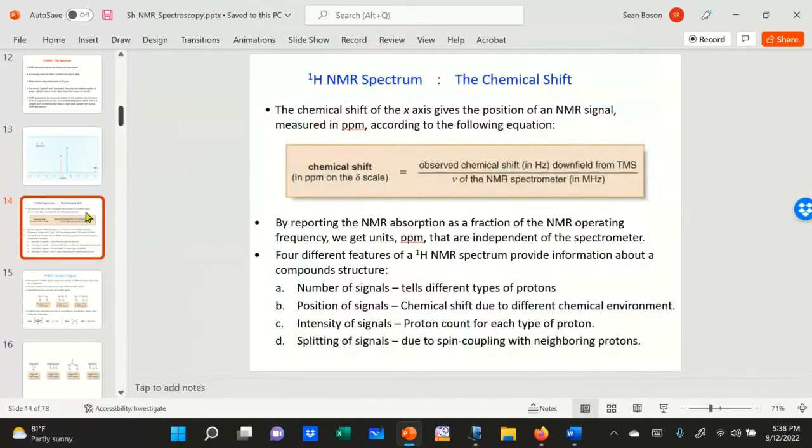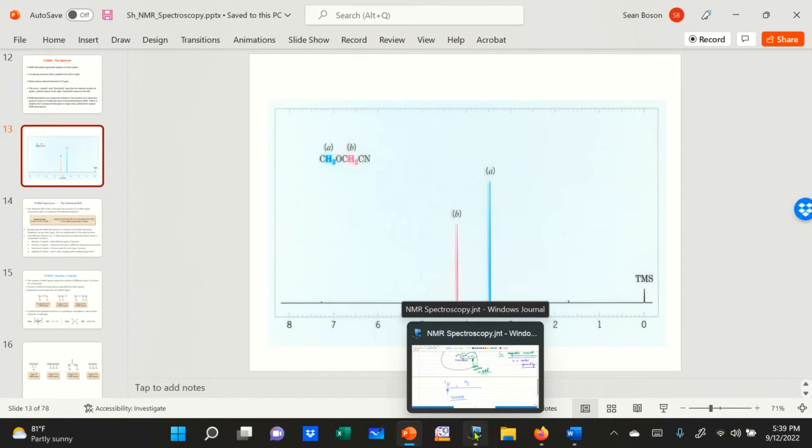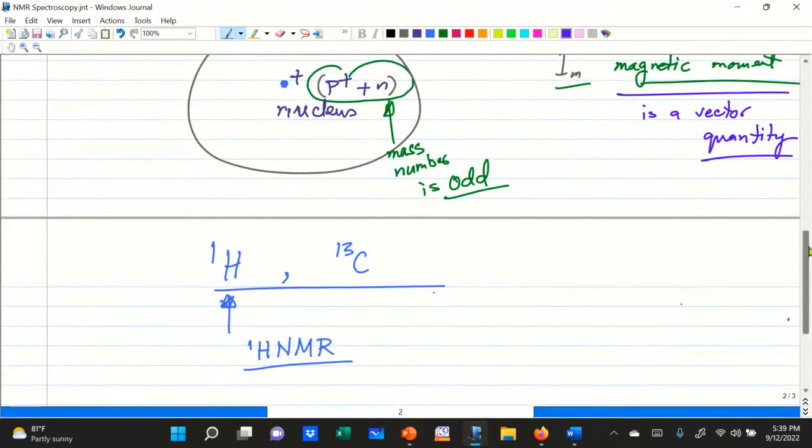Anyhow, coming to our NMR spectrum analysis, how can we understand an NMR spectrum? The biggest confusion comes from the fact that all protons are absorbing the same radiation. If they are all absorbing the same radiation, why in the world would they produce different signals? A quick dilemma comes right away. The answer comes from the fact that different protons in a molecule are in a slightly different chemical environment.